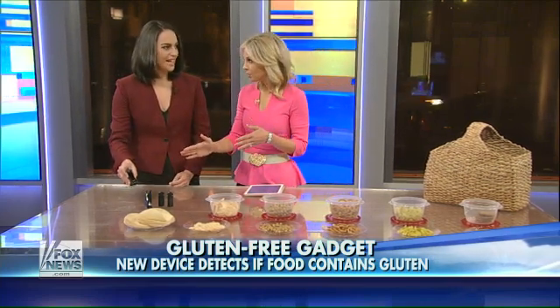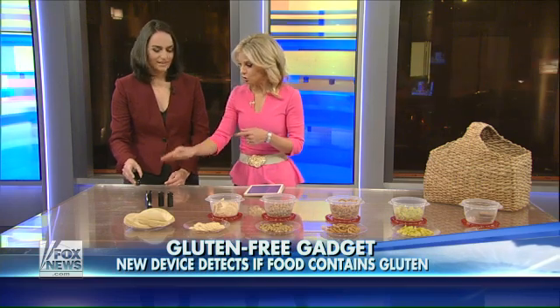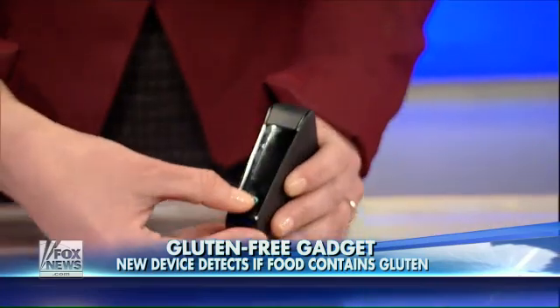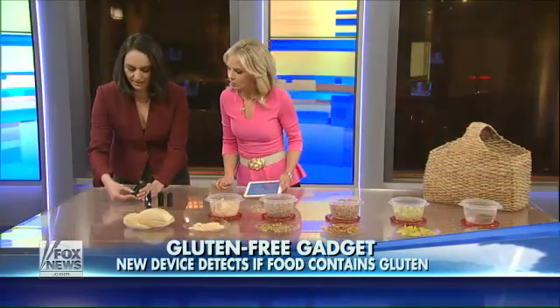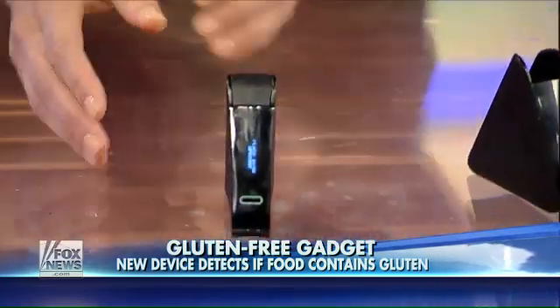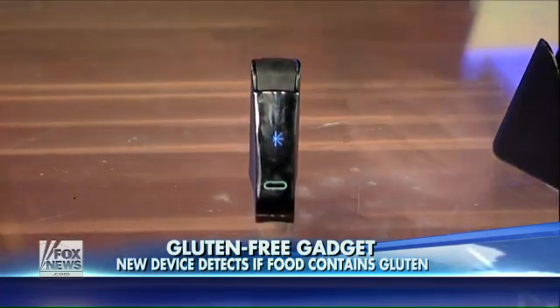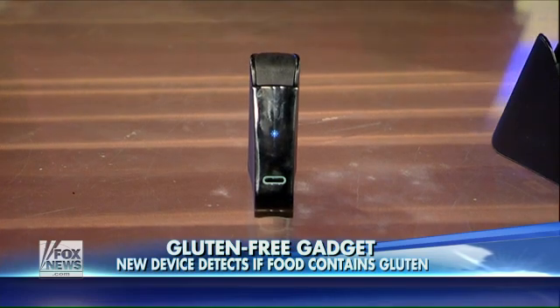This is NEMA. This is supposed to be one of the easiest ways to detect gluten in food. And you're working on other allergies. So you're going to drop the test right now. We actually already put a food sample in here, put it in this sensor, and then we're going to turn it on. In a few minutes, we're going to know yes or no whether or not at least 20 parts per million of gluten was in that sample — the amount that they say can do harm to your intestinal wall and your immune system.